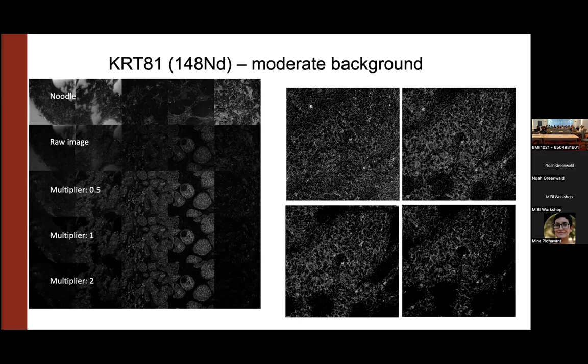It also helps with some downstream things, because then you have a more smooth distribution of counts, which helps for thresholds and all these other things. So we've incorporated it into this part of the pipeline because of all of the runoff benefits that it has. And you can see in this example, on the raw image, you almost cannot see cellular signal, or membrane signal, but as soon as you start moving it out and doing the background subtraction, you start seeing actual membrane signal.